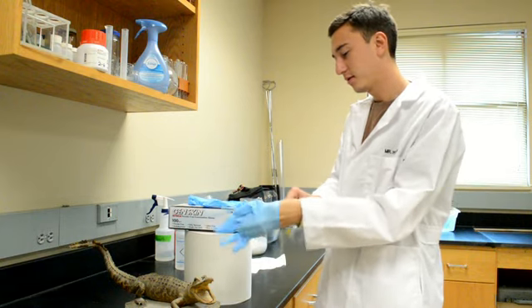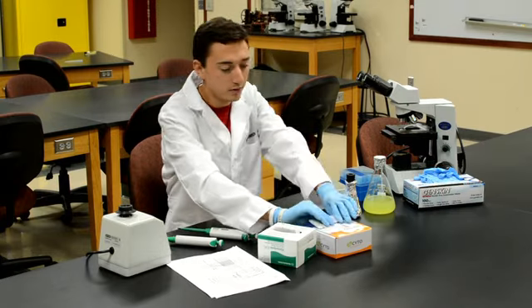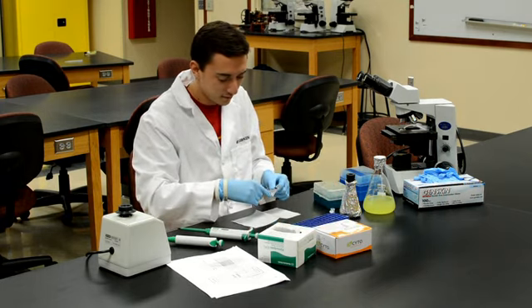Now that you have your supplies you are ready to begin. Start by putting on your gloves. Once your gloves are on retrieve your hemocytometer, unwrap it and place it on your Kim wipe.